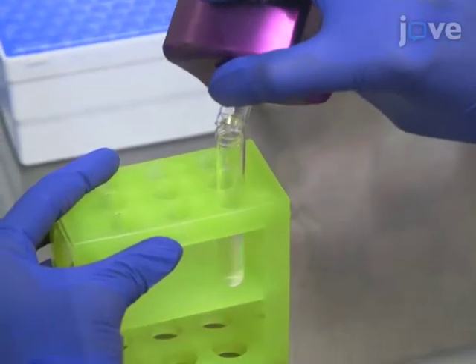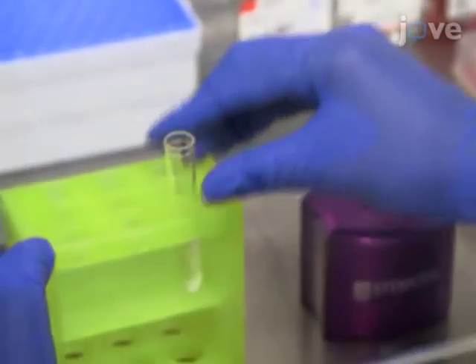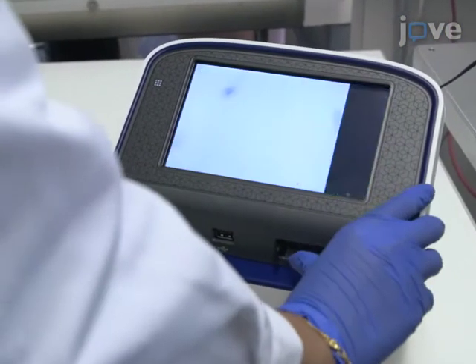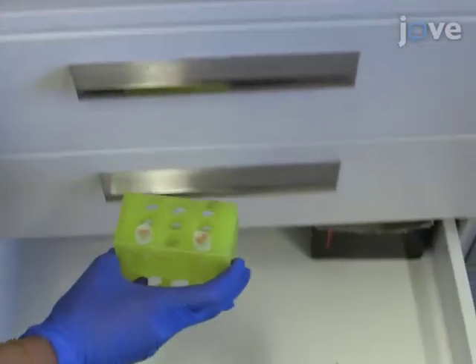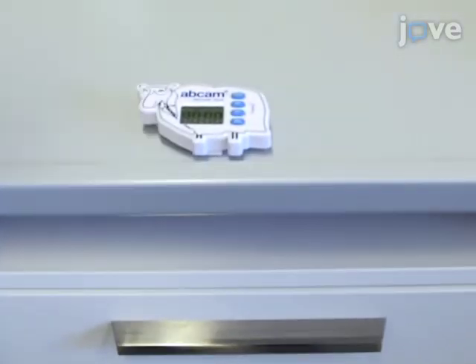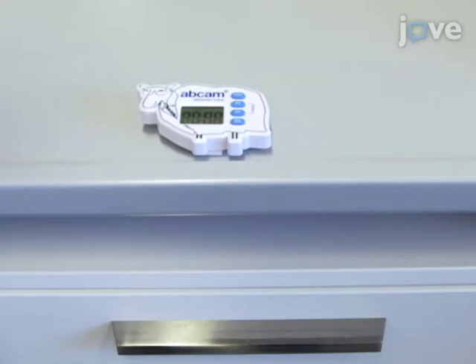After incubation, in one continuous motion, decant the cell suspension from the tube attached to the magnet in a new tube. Then, count the total yield of B cells in the suspension using an automated cell counter. To confirm the purity of the enriched B cells, incubate approximately 50,000 cells with anti-CD19, CD20, and anti-CD45 antibodies, coupled with different fluorochromes at room temperature for 15 to 30 minutes.